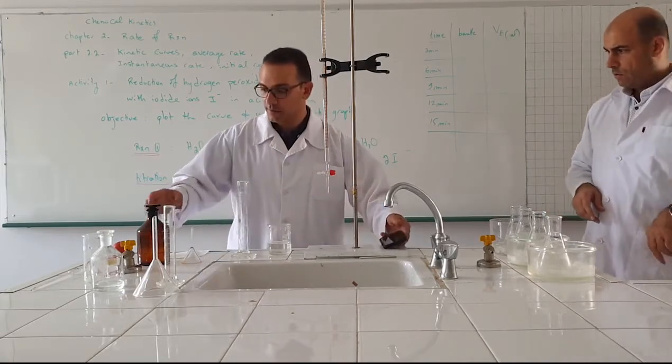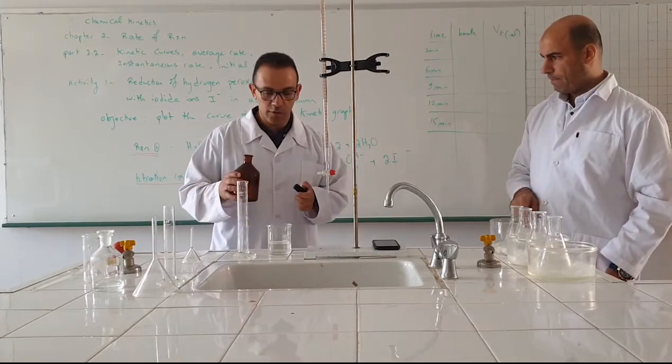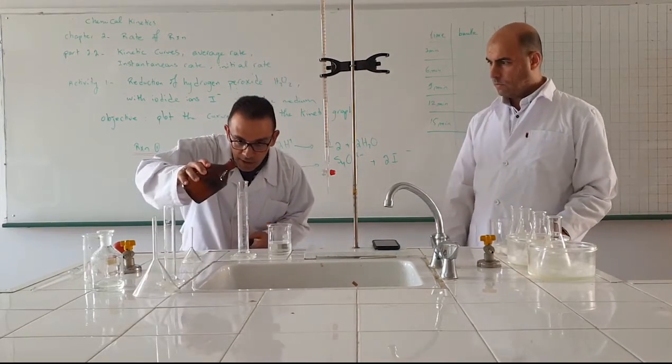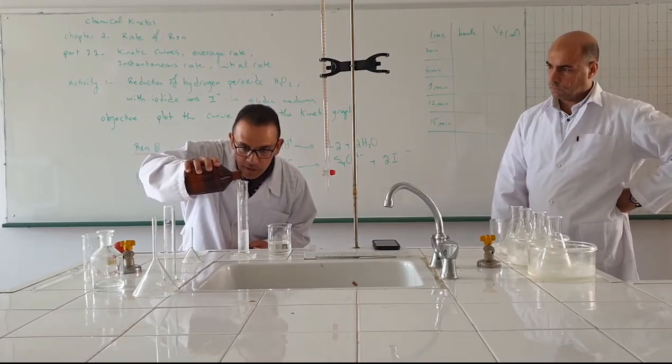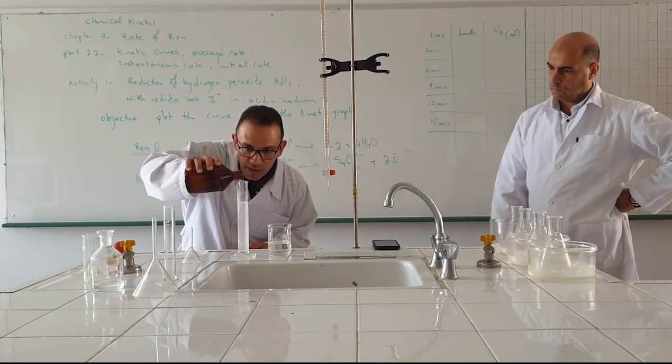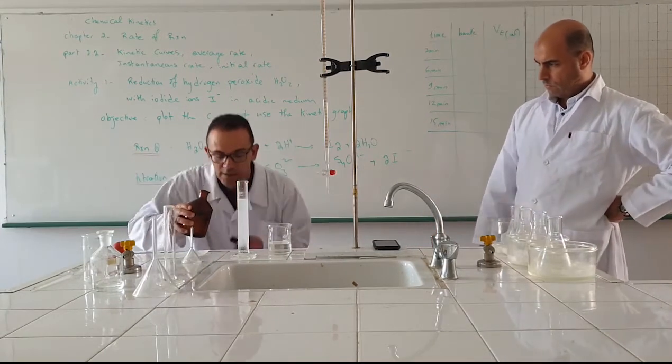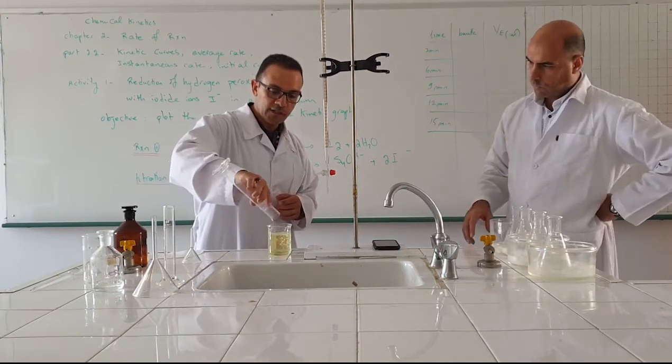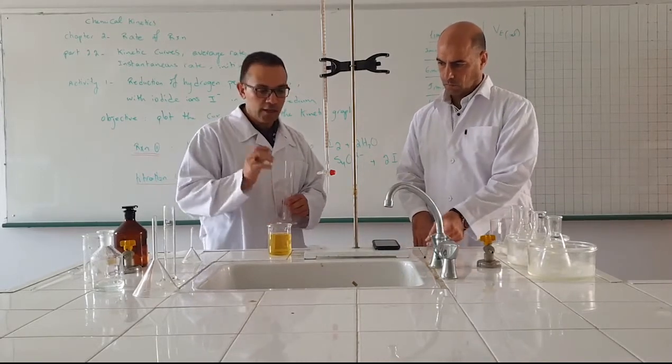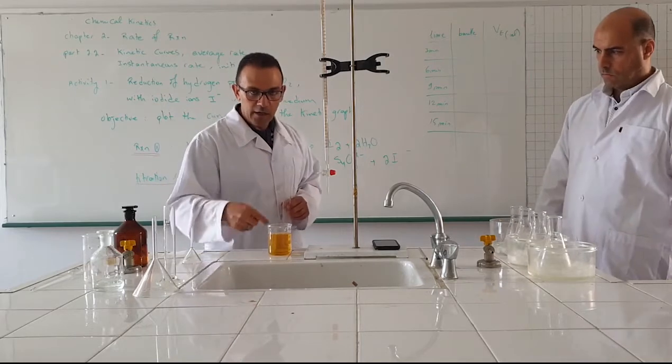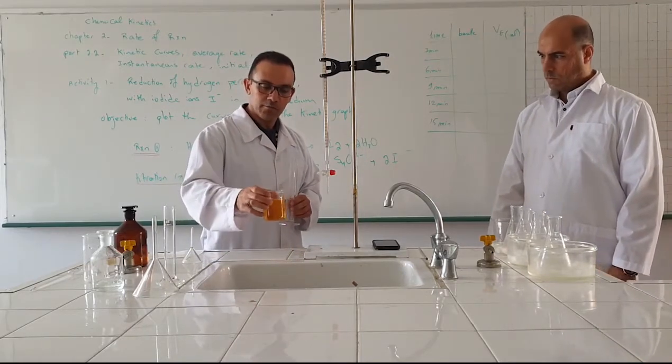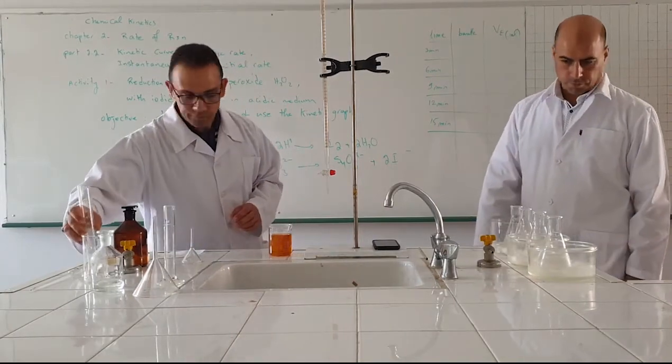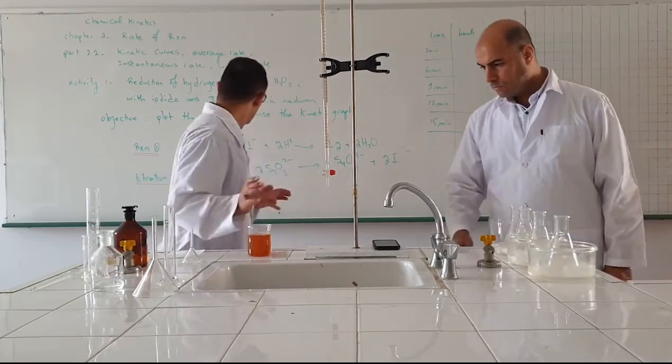Before adding, prepare the stopwatch so that we are going to start recording the time at the moment of mixing the hydrogen peroxide solution with the potassium iodide and the sulfuric acid solution. I am pouring 100 ml of hydrogen peroxide into a graduated cylinder. Now, add this 100 ml of hydrogen peroxide. The reaction starts. Observe that the color immediately turns yellowish meaning that iodine is produced. Color is becoming more intense, turns to yellow, more yellow orange color again and again, with the formation of iodine. This is the reaction mixture where reaction 1 is occurring.